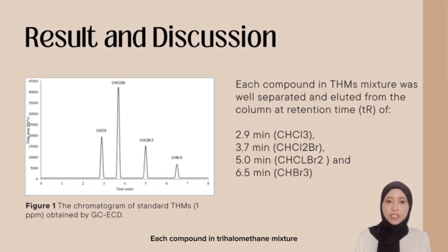Each compound in the trihalomethanes mixture was well separated and eluted from the column at a retention time of 2.9 minutes for chloroform, 3.7 minutes for bromodichloromethane, 5 minutes for dibromochloromethane, and 6.5 minutes for bromoform.